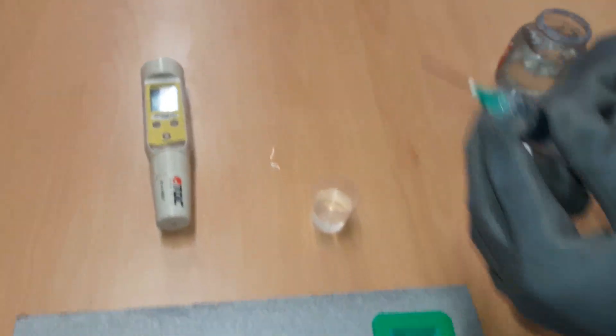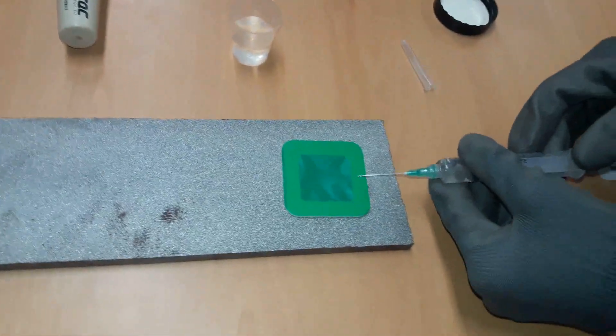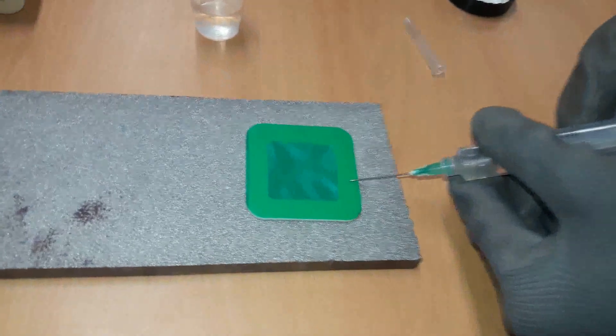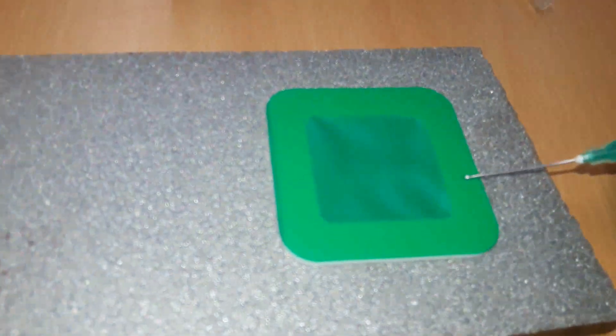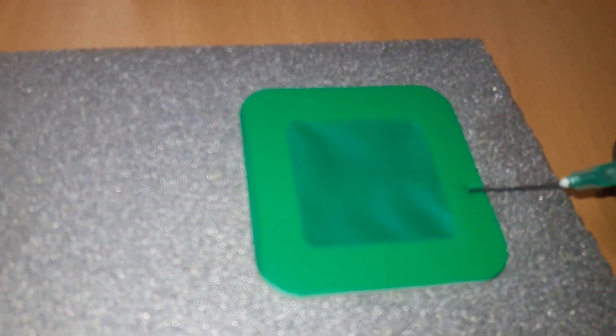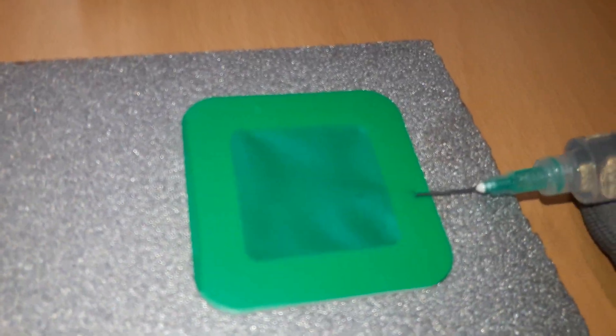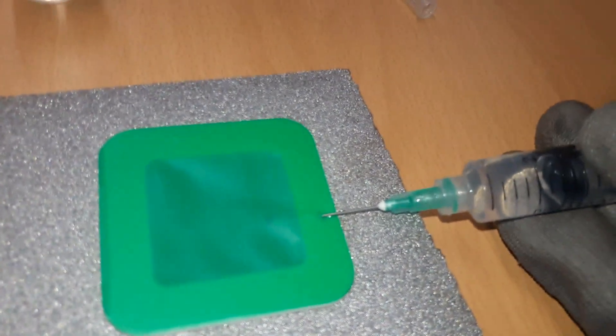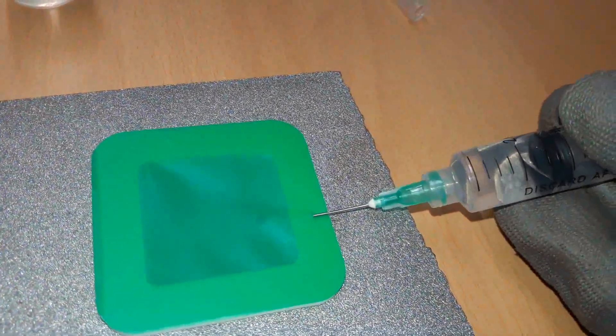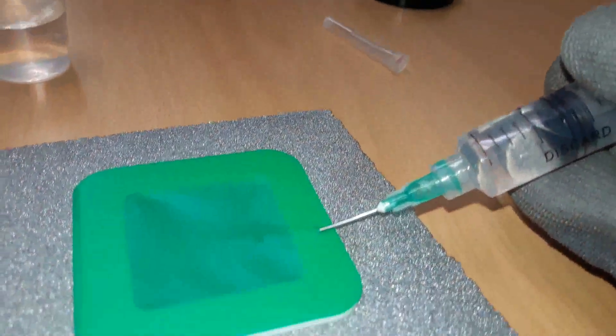Insert the syringe needle at an angle of 30 degrees to the test surface near the outer edge of the patch, so that it passes through the adhesive foam body of the patch into the compartment formed between the elastomer film and the test surface. If the patch is in a position which makes access to the patch compartment difficult, bend the syringe needle as required.